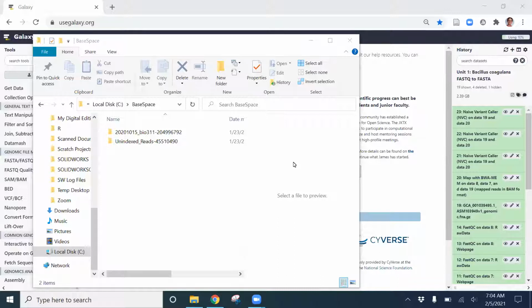Hi everyone, I wanted to make another video to show you how to get started with the project part of your assignments in the online bioinformatics class. So your first part to the project is to download the data from BaseSpace onto your computer. And once you've downloaded that data, you're going to want to upload the individual FASTQ.gz files to a new history called Unit 1 on Galaxy.